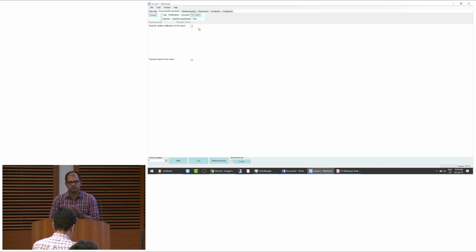If you had a library sample you wanted to match from, it can... But the library will be added anyways as evidence and in the MSMS table, right? You mean the library as raw data? Yeah, because then it's also matching to the library, but it doesn't matter, right?